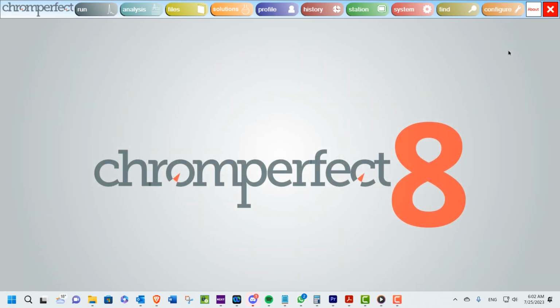Note: if your Chromperfect license supports size exclusion chromatography (SEC), then several SEC-related features within the analysis program will be active, otherwise, the corresponding menu items will be dimmed. These features are discussed elsewhere. As most users do not use SEC features, we will not cover them in this video, however we hope to produce more SEC-related content in future.